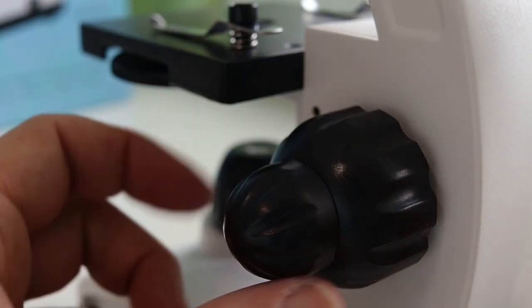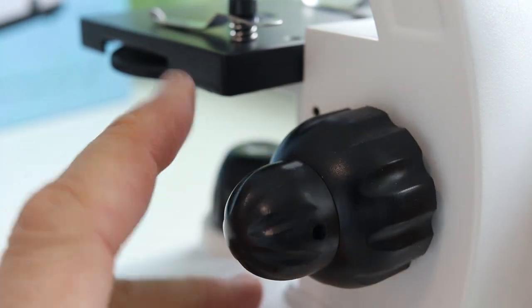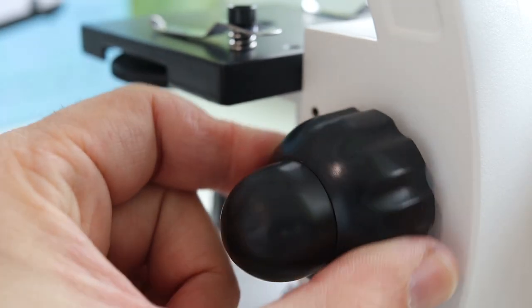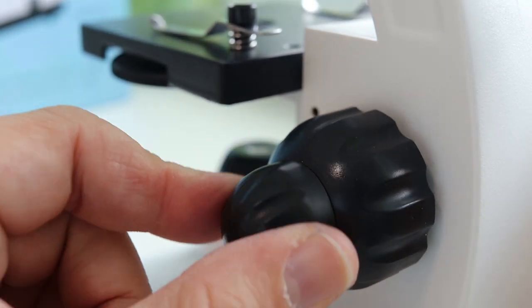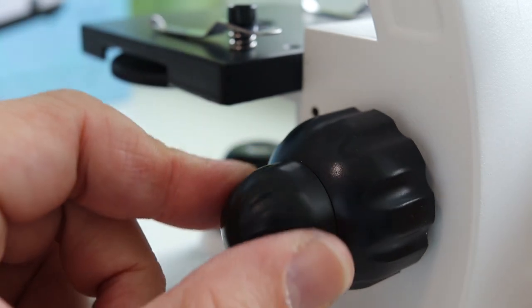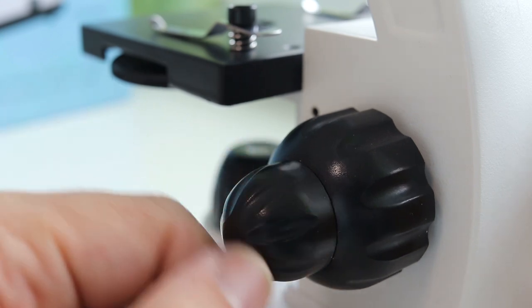The microscope has a coarse and a fine focus knob, so you can see that the stage can be raised and lowered quickly by turning the coarse focus knob, and by turning the fine focus knob, the stage goes up and down only slightly, for making more precise adjustments to the focus.